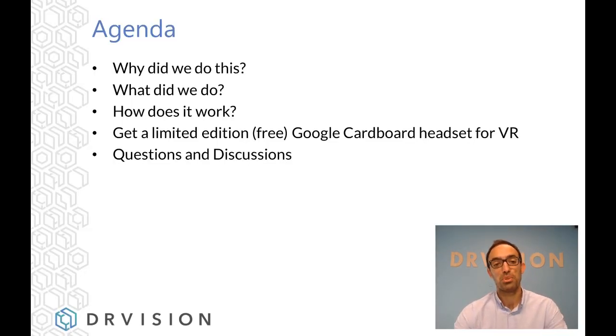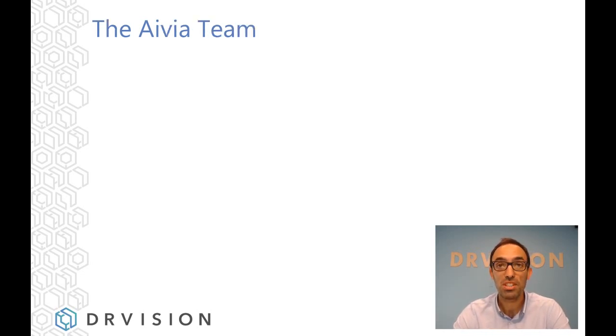So first, we will start with a brief description of why we're doing what we're doing. Then, what are we actually doing? How does it work? And at the end, we will have some information about a promotion that we have for a giveaway. There will be time for questions and discussion at the end. So if you want to stay back and have a little bit more time to discuss things in more detail, you're very, very welcome.